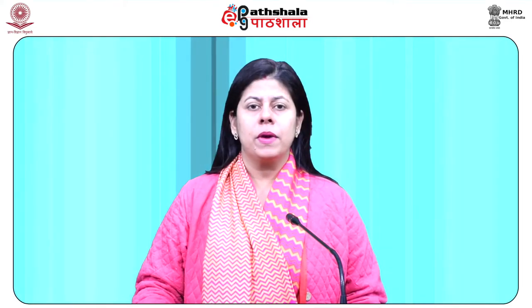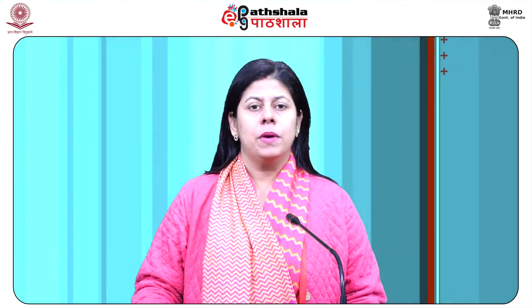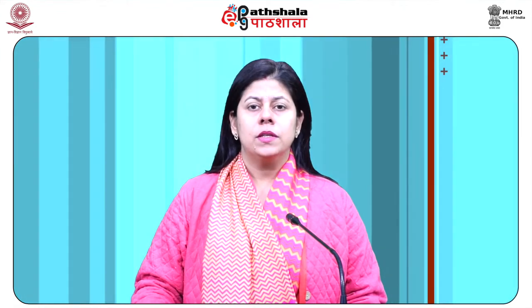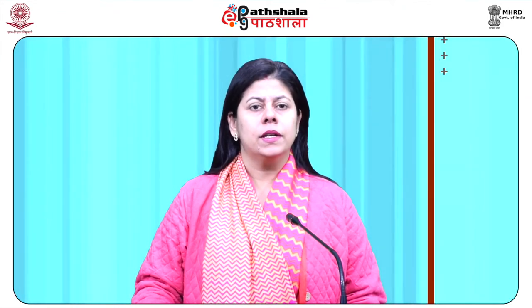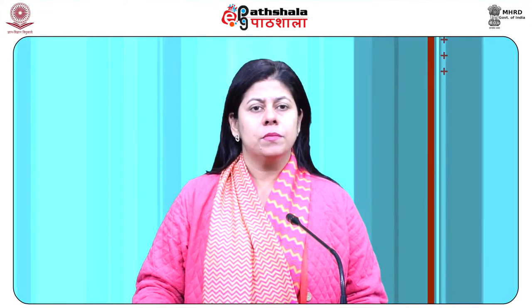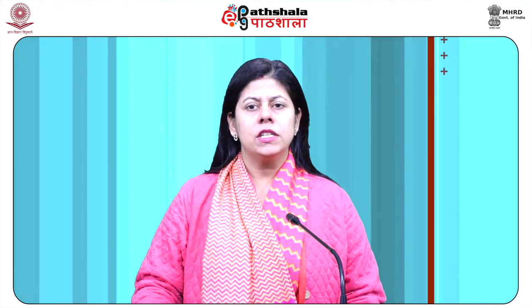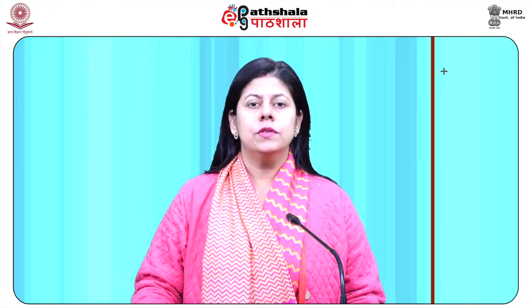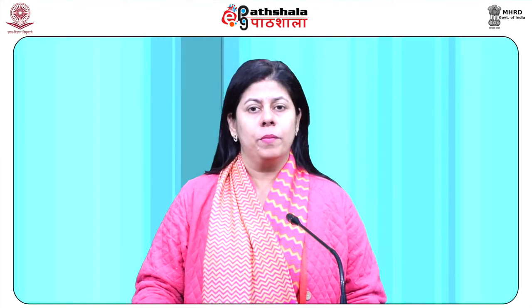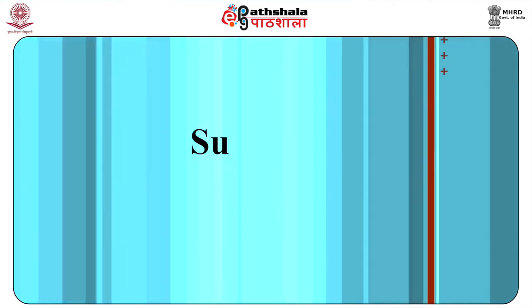The phase contrast microscope is widely used for examining such specimens as biological tissues. It is a type of light microscopy that enhances contrast of transparent and colorless objects by influencing the optical path of light. The phase contrast microscope is capable of displaying constituents in a cell or bacteria that would normally be difficult to see. Now let us summarize.